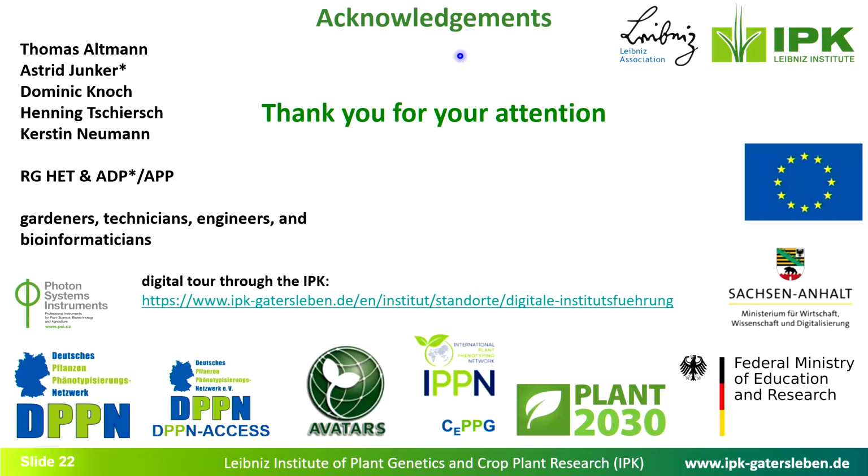Okay, thank you. Thanks for the great talk, and it is amazing how capable the PhenoSphere at IPK is. My question is actually a little bit more philosophical, because we know there are infinite possible combinations of fluctuations, and could be temperature, could be light, could also be a combination of both. In the future, if someone would like to conduct an experiment, which kind of combination of fluctuation would you suggest? It's a good question.